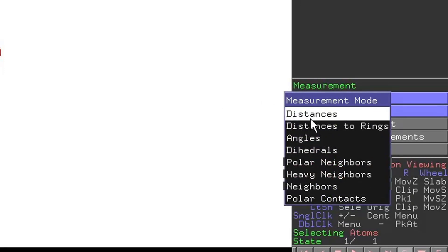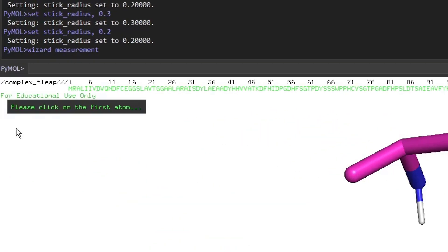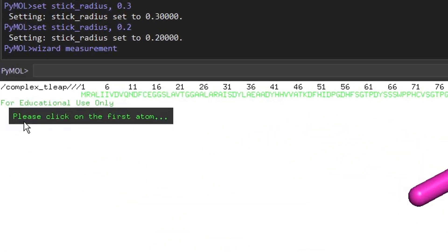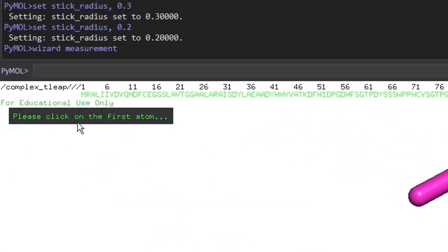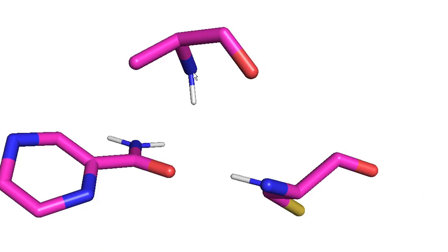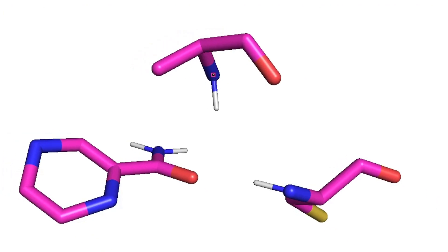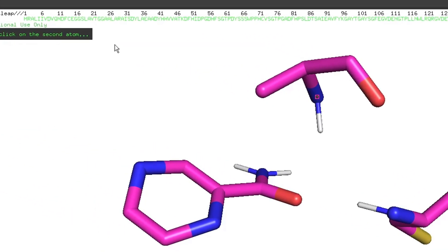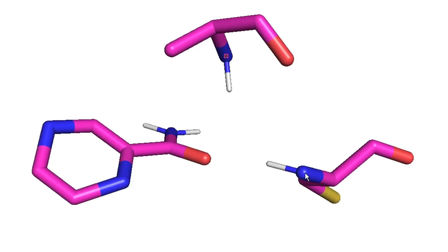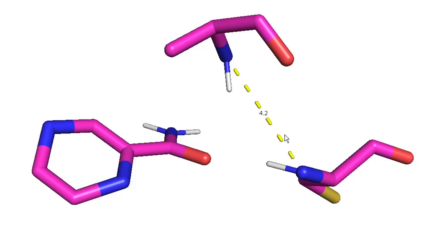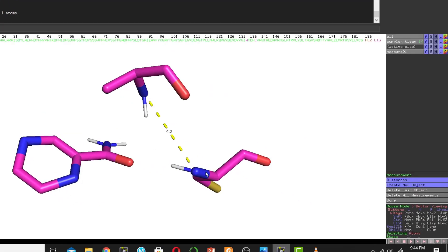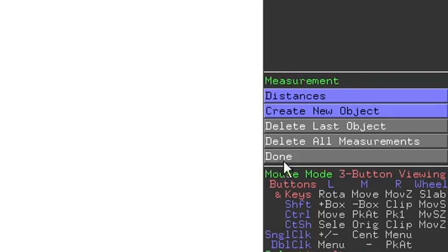We will measure distance. The interface asks you to click on the first atom, so click it, then click on the second atom. The distance is now drawn between these two nitrogen atoms. When finished, click the Done button.